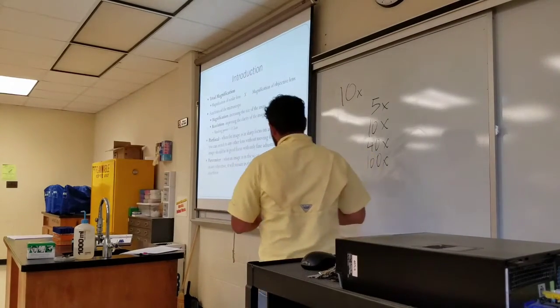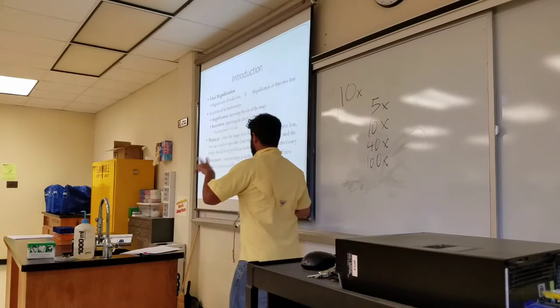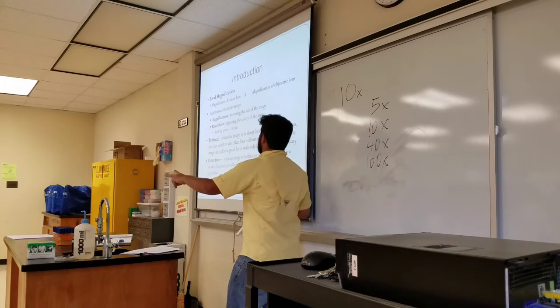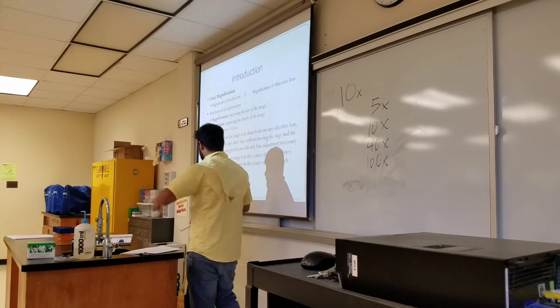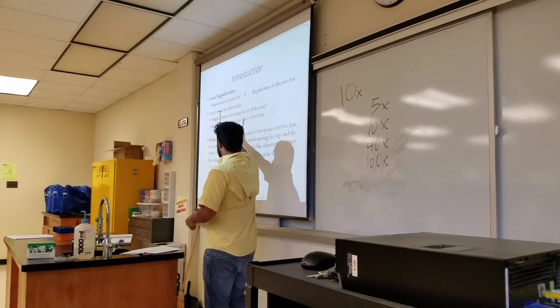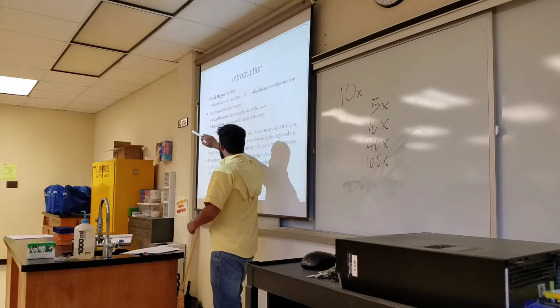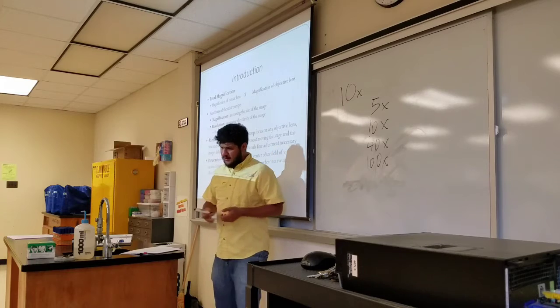Now, we have these microscopes. They have two main purposes: increasing magnification, so magnifying, and giving us resolution. The magnification is increasing the size of the image. The resolution is improving the clarity of the image.